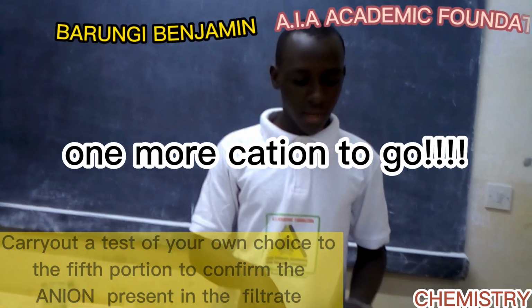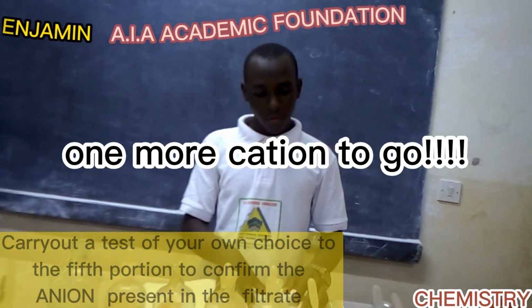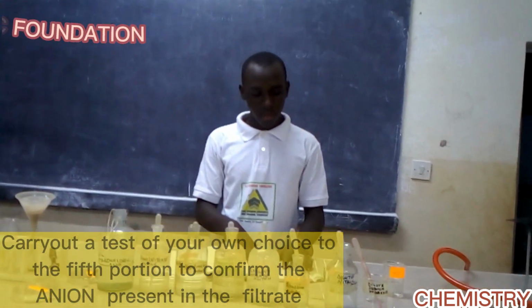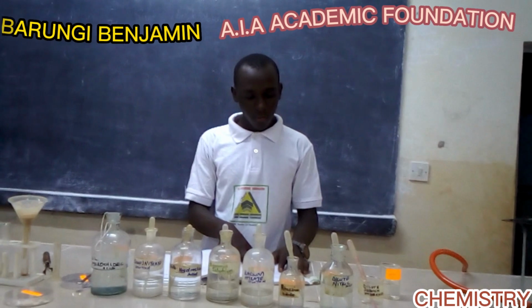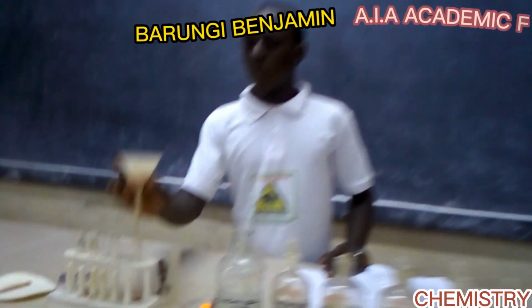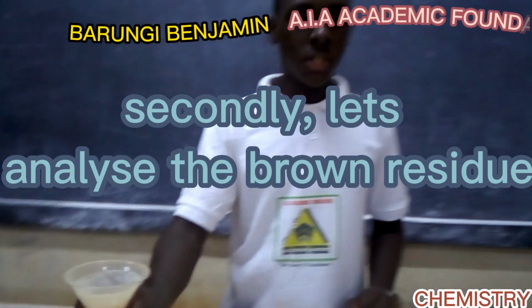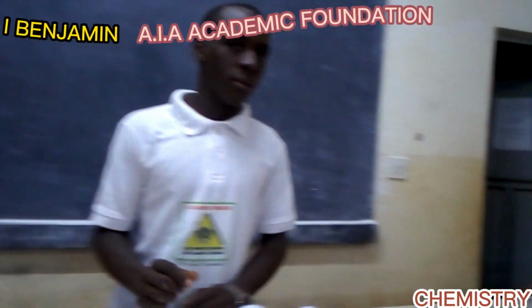So they have given us another instruction. They have told us to wash the residue obtained above with aqueous sodium hydroxide and dissolve. So this is our residue we kept. We are going to wash it with sodium hydroxide.